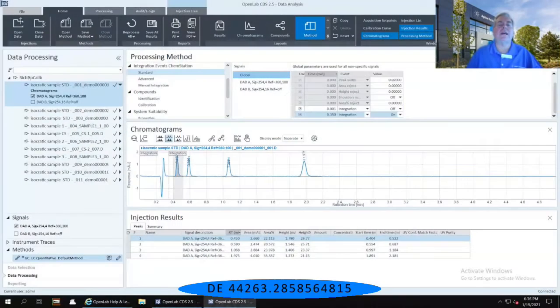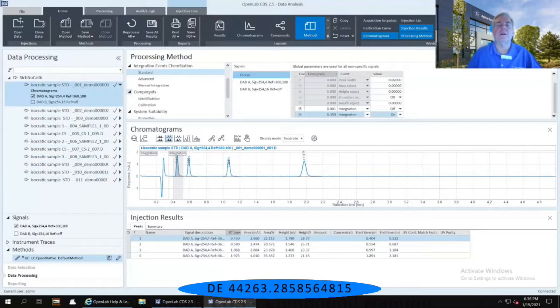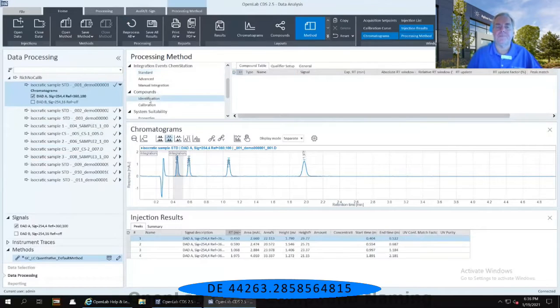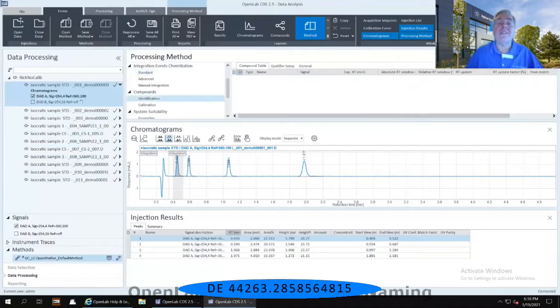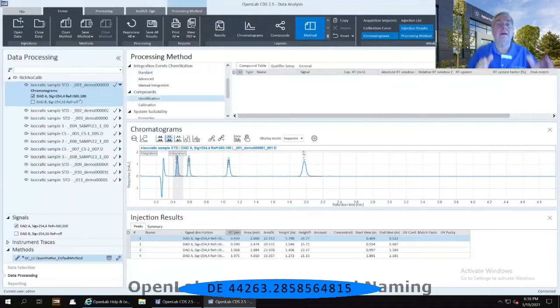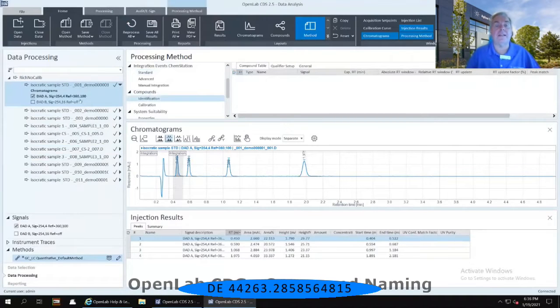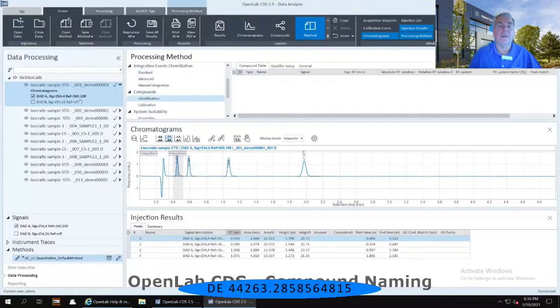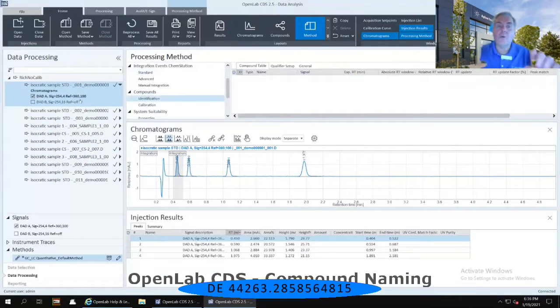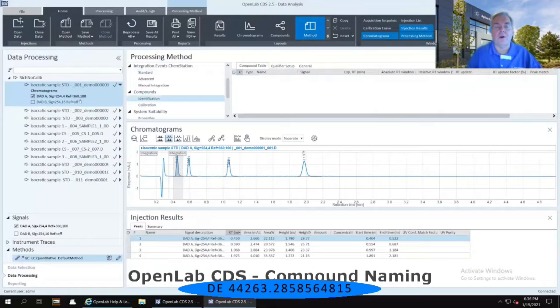I want to go down to my compound section and identification. Now with the first injection highlighted on the left-hand side, in the chromatographic window, currently my first peak is highlighted.